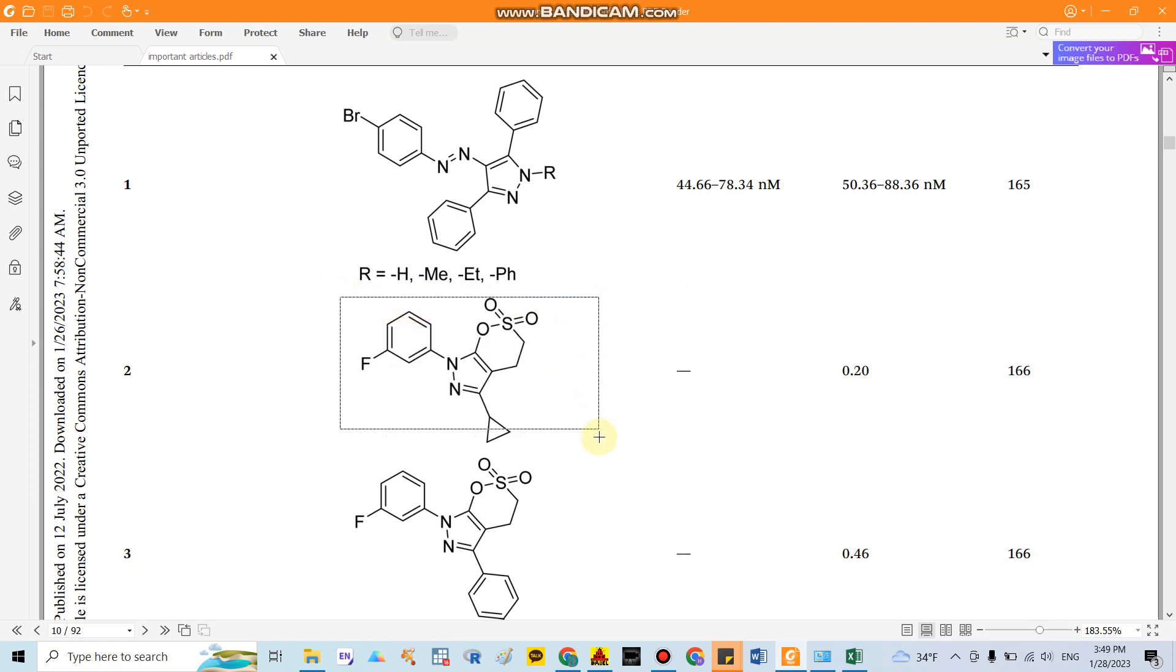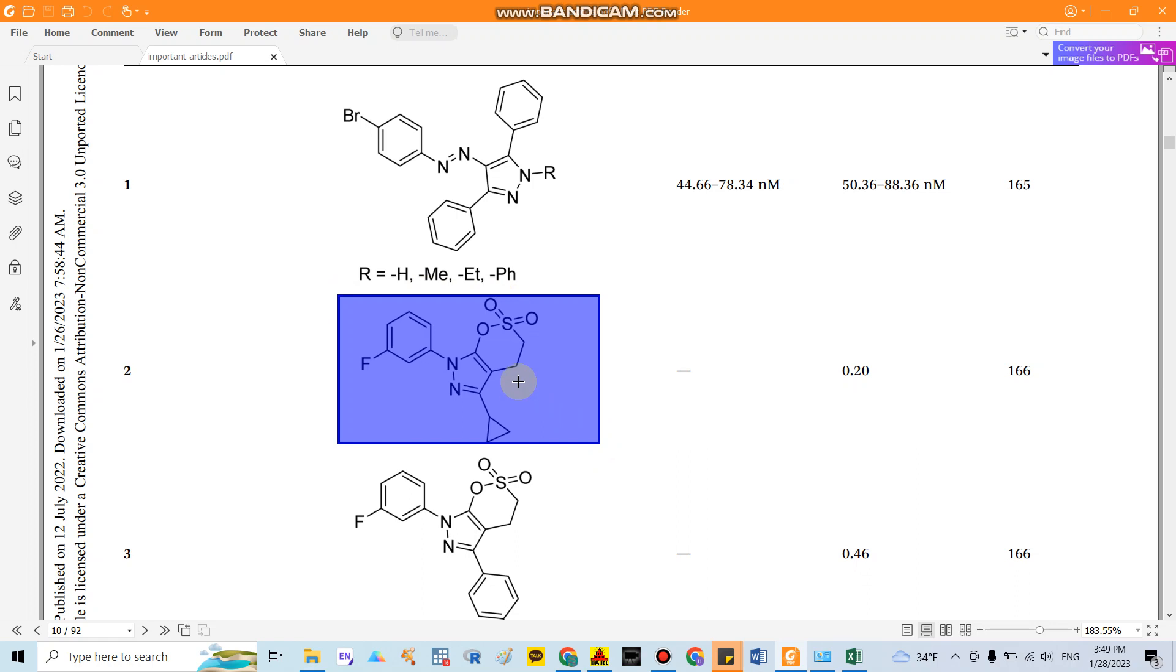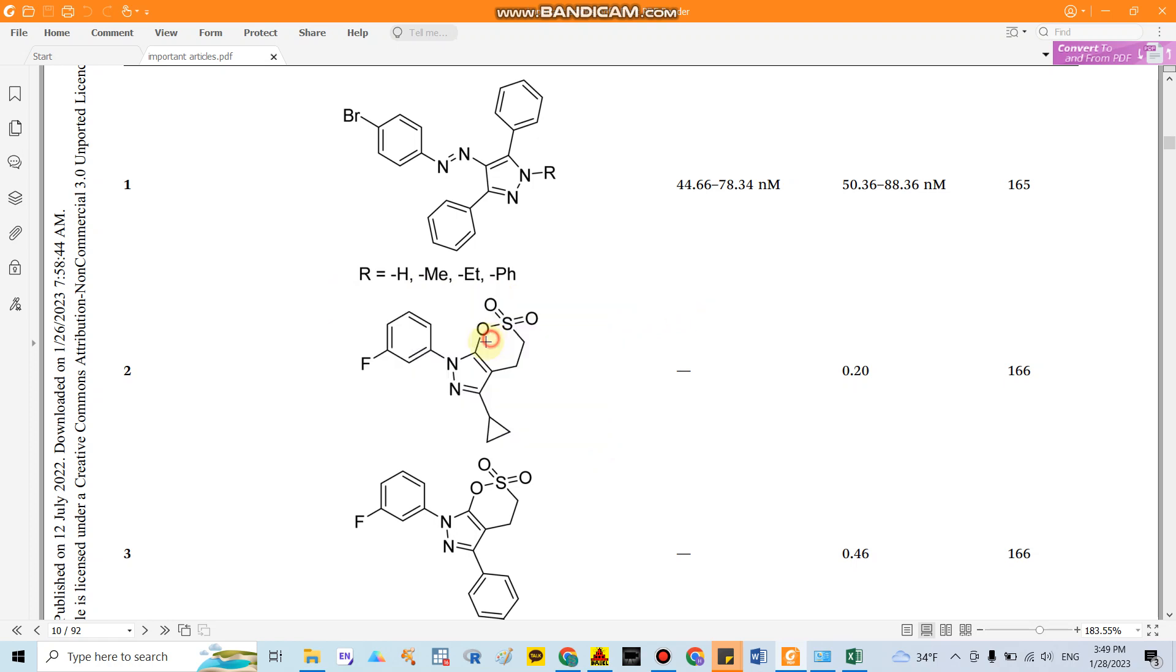When we don't know the name or we want to get the SMILES and do further research, for example we want to detect physical chemical properties or pharmacokinetics or drug likeness or synthesis characteristics.